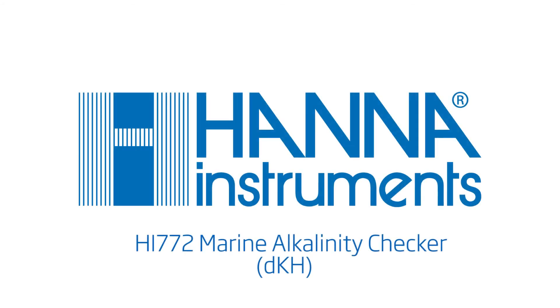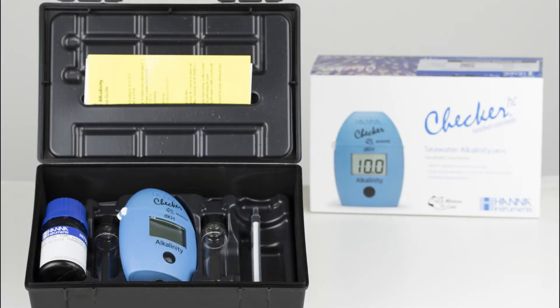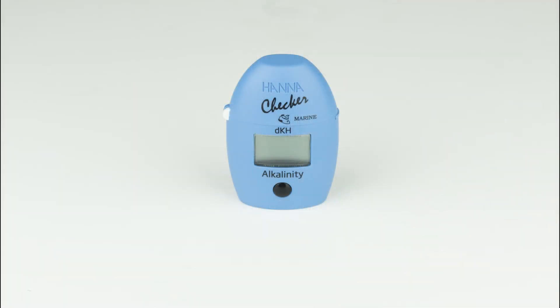The Hanna Instruments HI-772 Marine Alkalinity Checker is a compact and portable colorimeter that bridges the gap between simple chemical test kits and professional instrumentation. The one-button design allows users to operate the meter with ease. Today we will go over the proper use of the HI-772.